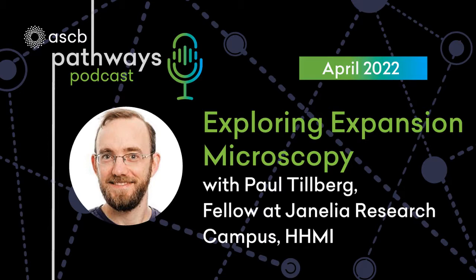That is very cool. And you could imagine making a hairspray analog that is swellable. I mean, if the hairspray actually formed a swellable gel, then you could swell it, but you probably would not preserve features on the length scale that you would need for swelling. But anyway, sometimes it's fun to think about crazy things.